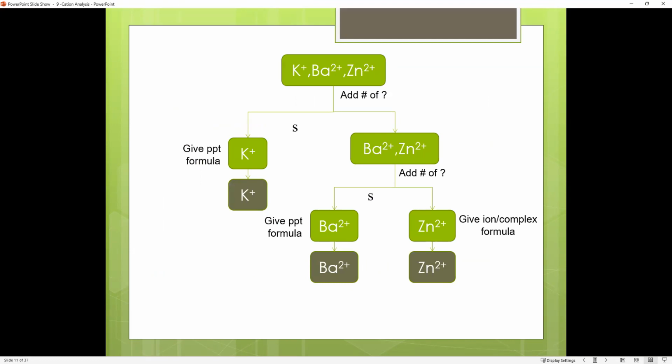And so what we used to do is have it as a 3-week lab. The third week was the lab practical, similar to what we use the group projects for currently. The idea behind it is that you would collect data the first 2 weeks, just doing the same thing you're doing in this one, but with different counter ions. And then afterwards, you collect all the data, then you can come up with a scheme to be able to separate these 3 ions. This would be the pre-lab, and then lab would be separate 7 ions.